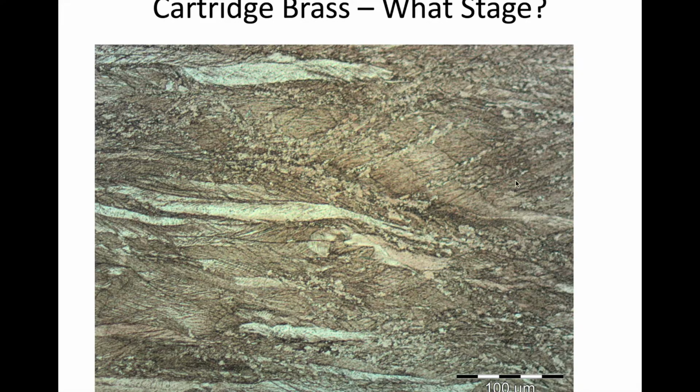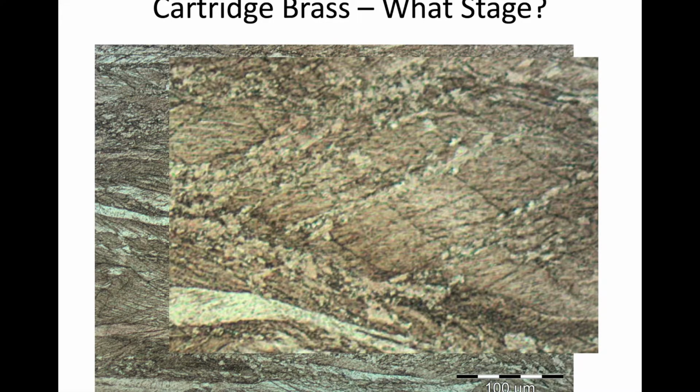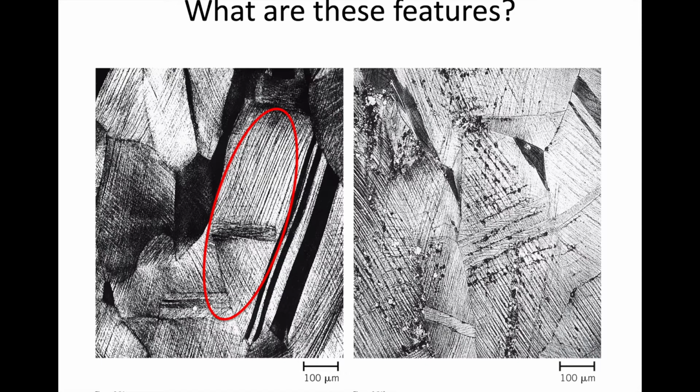You see that there are some patterns, right? They are forming in distinct regions. It is not completely random where they occur, right? So just take a look at where these clusters tend to form and the directionality of that. Same thing, if you zoom in, you see that and a lot more, right?